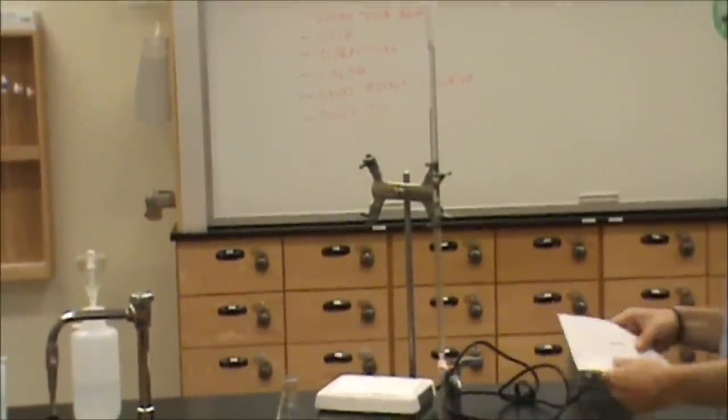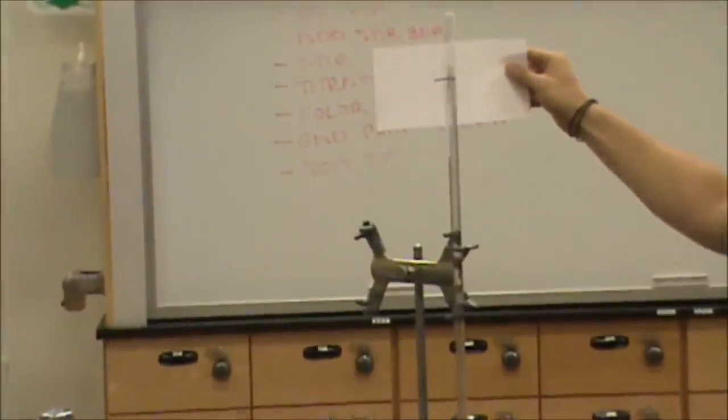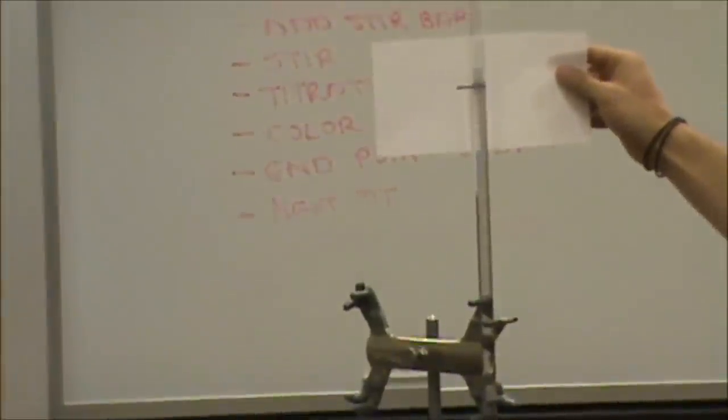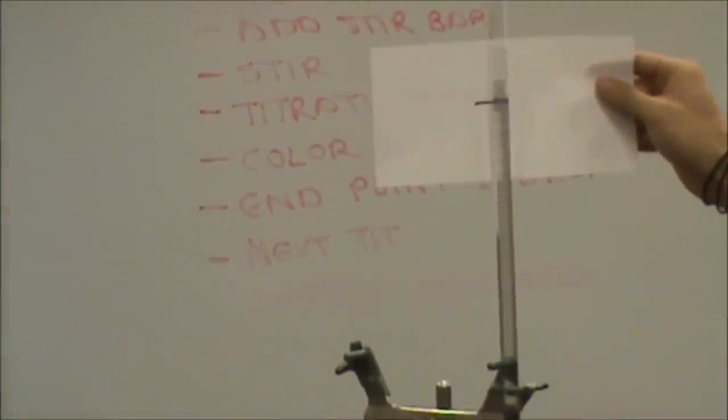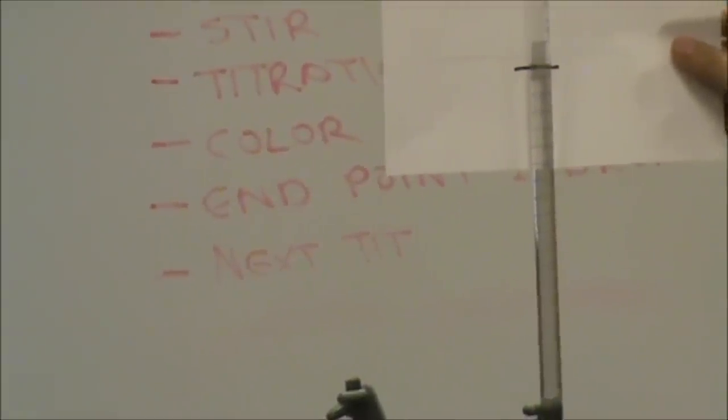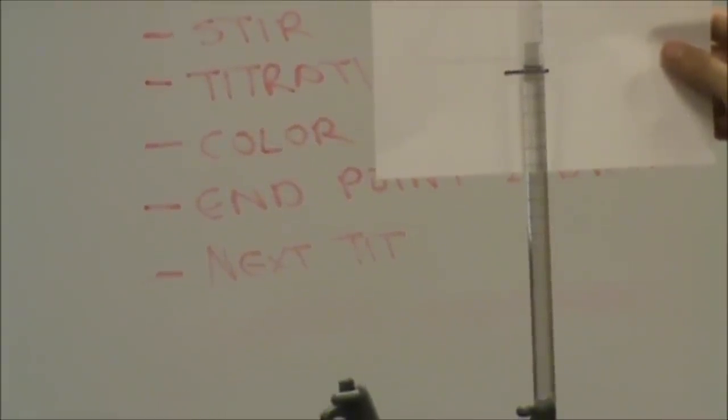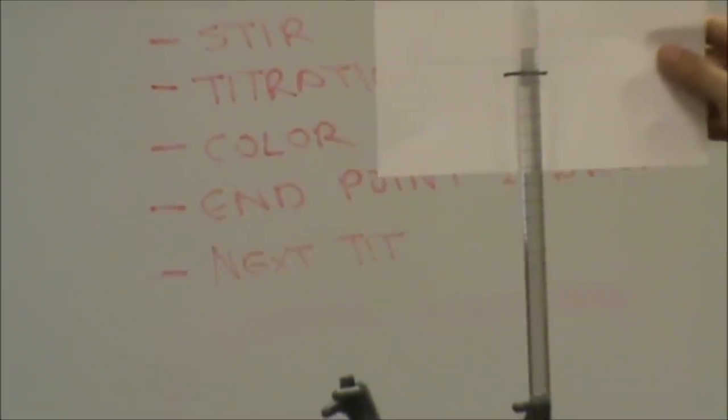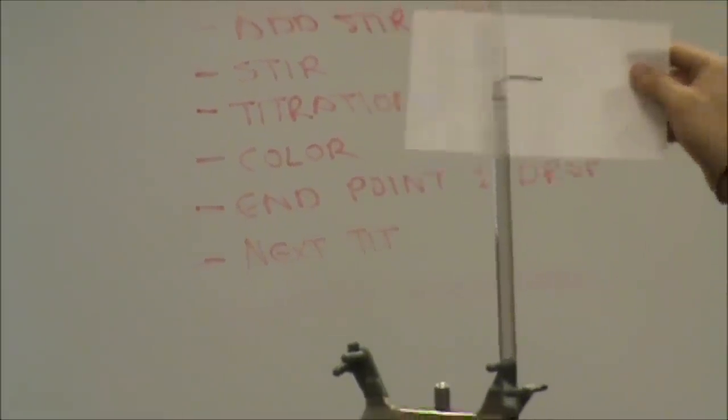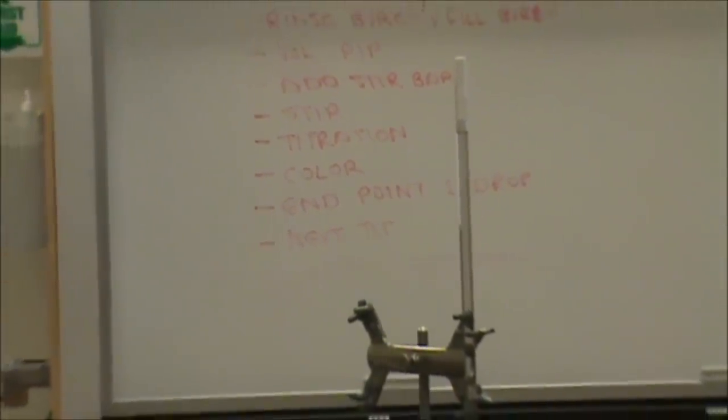A trick that may be used to help us see the level of the fluid is to take a white piece of paper with a black line drawn across it. That's going to allow us to easily pinpoint the bottom of the meniscus. One thing to note is that these burettes are marked to the nearest tenth of a milliliter. So, if we're using proper sig fig rules, we want to go to one decimal place beyond that. I would say that this one currently contains 1.47 milliliters of fluid. You'd want to record that volume to two decimal places into your data.